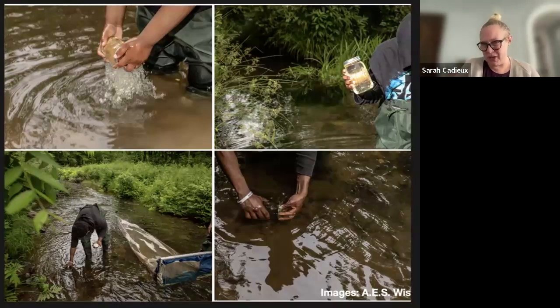The data I'm going to show is just going to be the grab samples, because the net sample had so much organic material that through many, many iterations of digestions, it's not very reliable still. And I'll show you one image that shows some of the organic matter still present. And so these images, again, were taken by Allie.